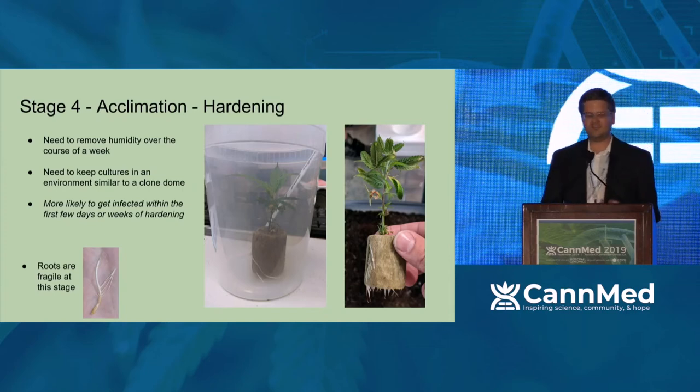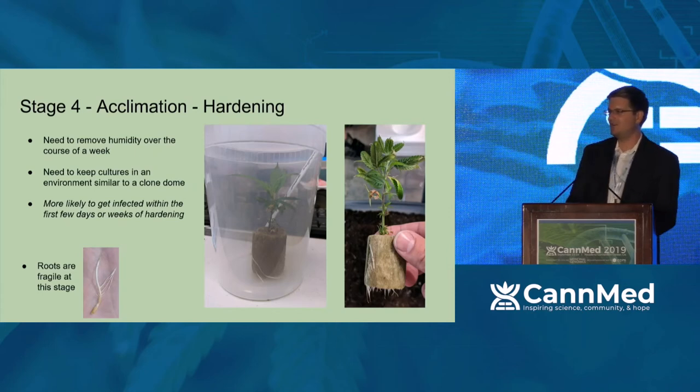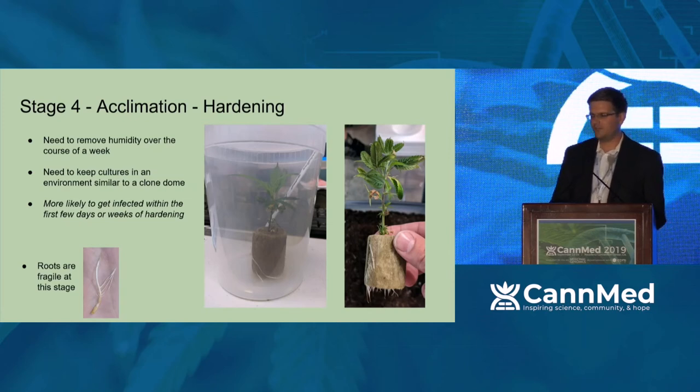Now, I should mention, as I was pulling some of these plants out of culture, the roots would snap off if I accidentally touched them or I brushed them against something. So they are extremely fragile at this stage. They've been growing in basically a jello substance the entire time. At that point, you can pull it out, you can wiggle it around, they might not break off, but you go flicking those or tapping them, there's a good chance they will. The plants are not accustomed to that. They haven't developed the resistance in the structure to really be able to move around that much. They were never agitated in the beginning. There was no wind in the tube. Don't expect there to be wind the second you take them out.